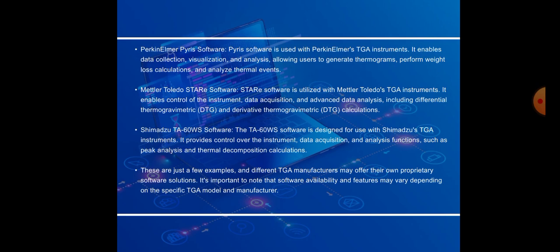These are just a few examples. Different TGA manufacturers may offer their own proprietary software solutions. It's important to note the software availability and features may vary depending on the specific TGA model and manufacturer.